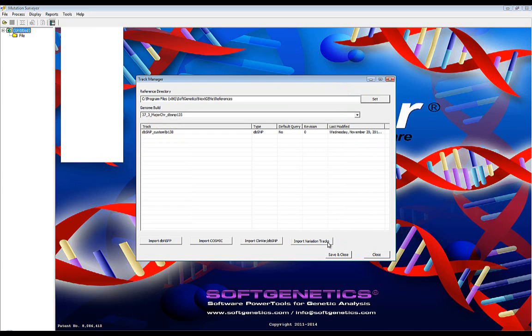To import annotation databases such as dbSNP, dbNSFP, and COSMIC, simply select the option at the bottom of the screen to launch an import wizard, and if you have any questions, simply contact us by telephone or email.